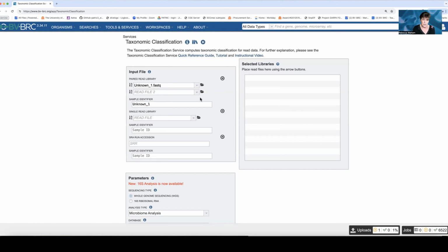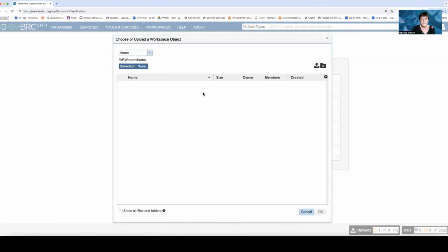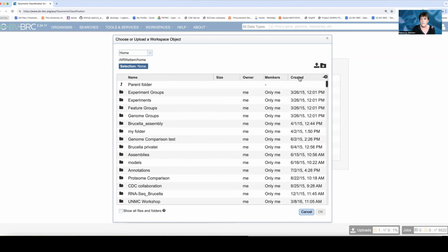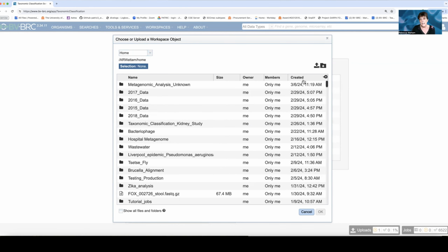But let's start the other upload because it's going to take a long time. We don't want to wait for this one to upload and then start to upload the other one. We would be here all day. So let's click here on this folder icon. I've got to go back to that particular folder. So I click created, it shows me the earliest. I click created again, it shows me the latest.